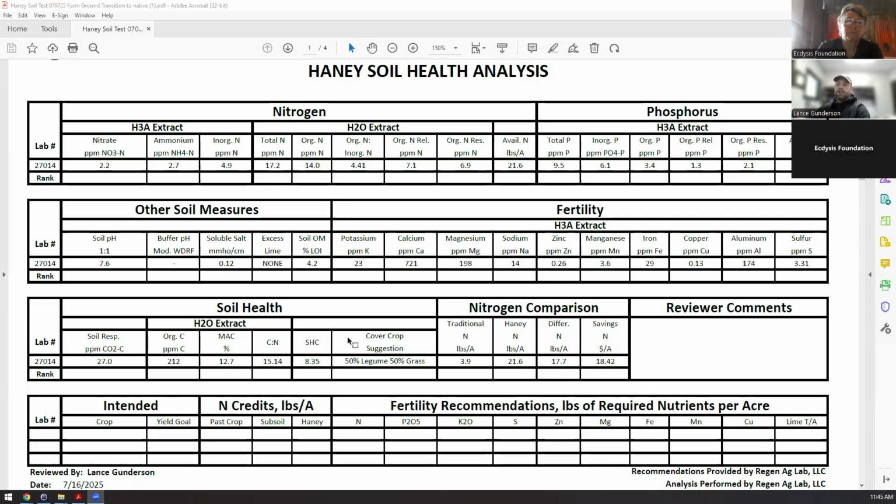Also, keep in mind the term high is relative. I've had a lot of people tell me, "Oh man, my soil test phosphorus levels are really high." And they're 35 or 40 parts per million. And I said, I see soil test phosphorus levels over 800. Now that's high. So it's something to keep an eye on.